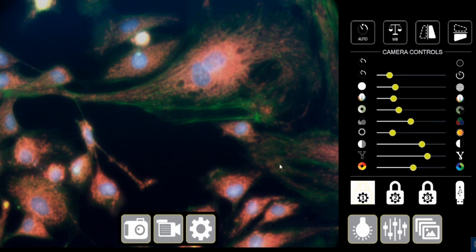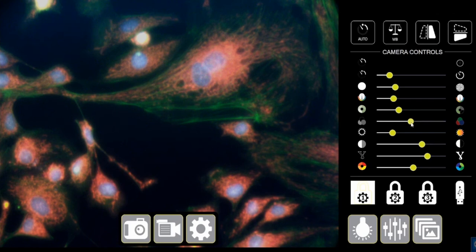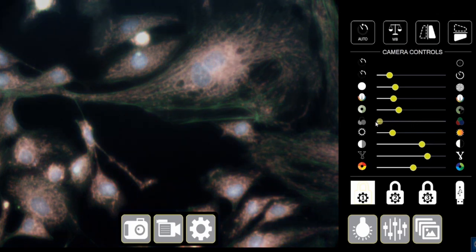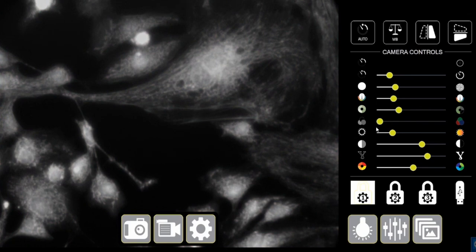And what you see is what you get just to give you an idea of how traditional way was followed to take images. I'll try to recreate it using the color to grayscale button here. So if I slide it all the way down to grayscale, this is how traditionally a grayscale image would look like. So you can see you have lost all detailing.